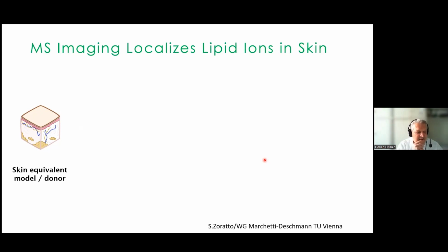MS-based imaging, MSI, performs spot-per-spot mass spec over the sample area in a matrix, and allows for absolutely label-free and antibody-free detection, identification, and to some extent also quantification of single lipid species.